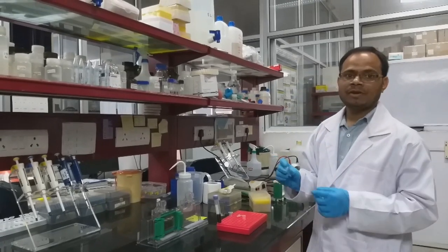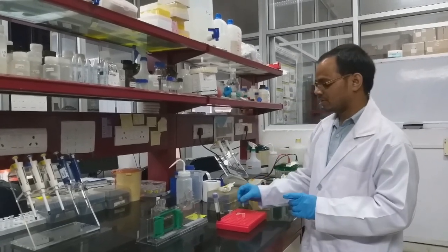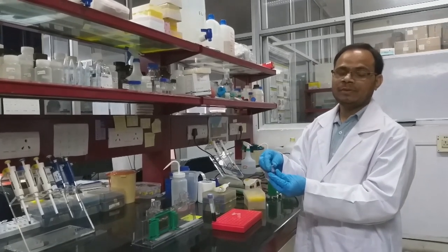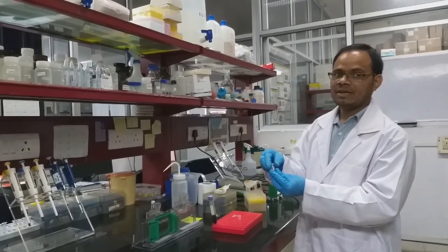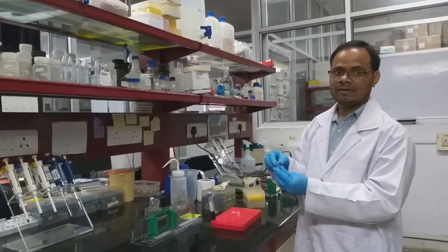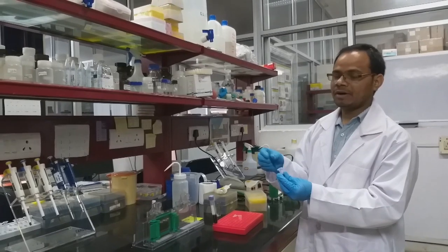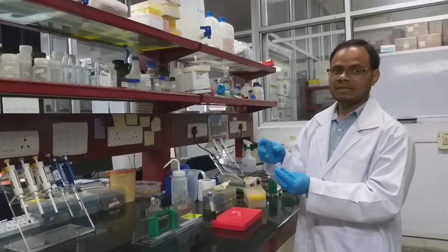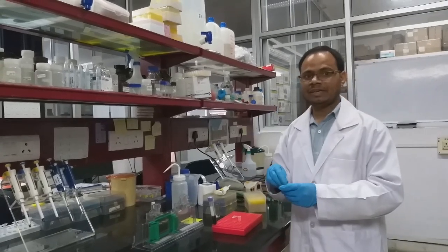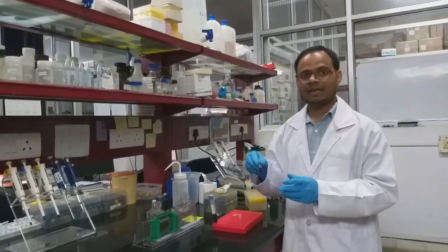You can tap it or pipette this protein solution, then we have to heat it for 3 minutes at 100 degrees Celsius so that all the polypeptide chains, dimers, and any multimers that are present will break down and we can see a nice band. So I am going to heat this at 100 degrees Celsius for 3 minutes.